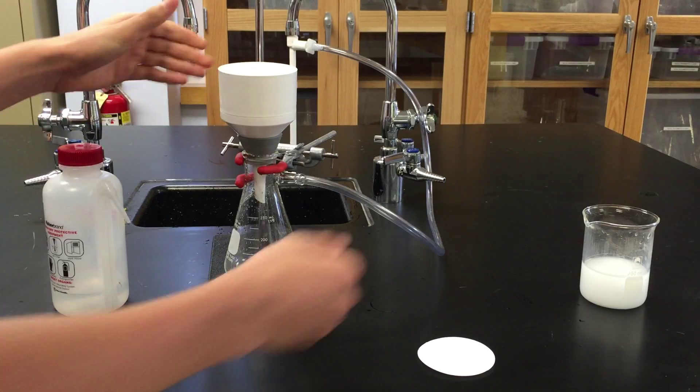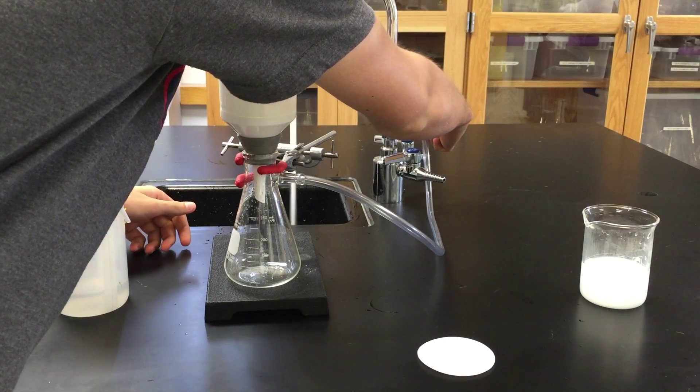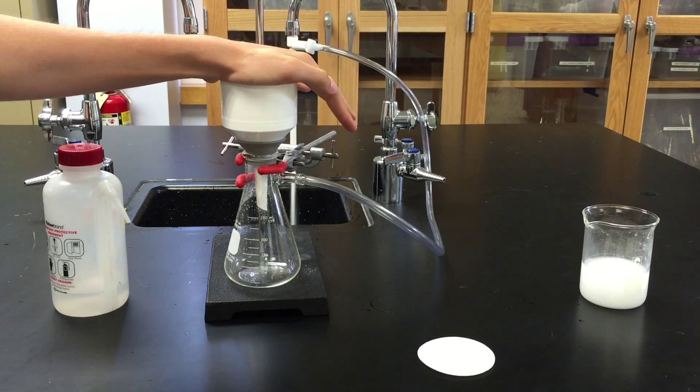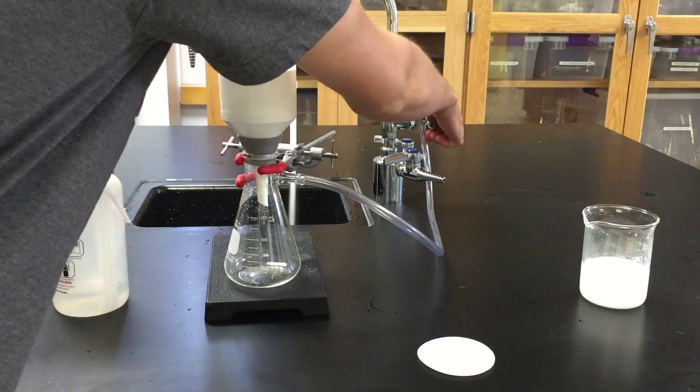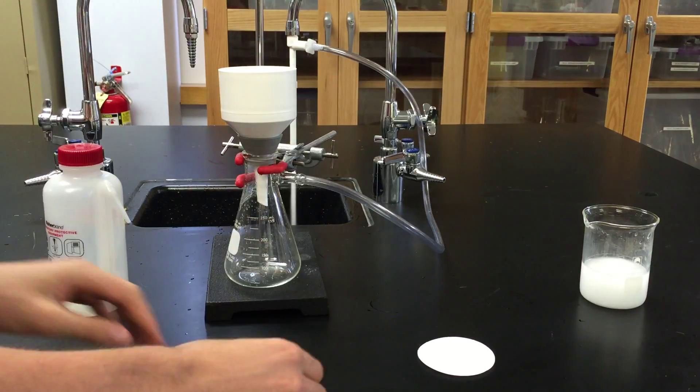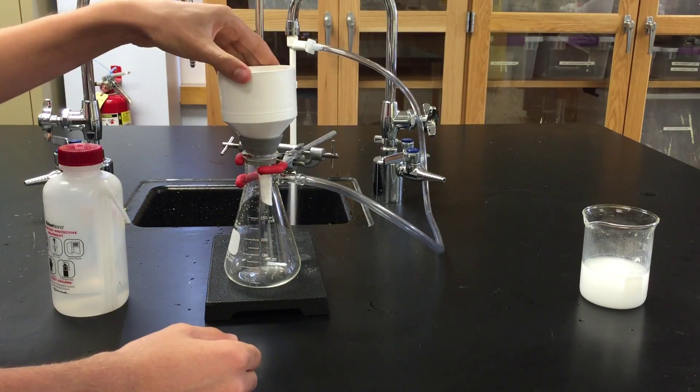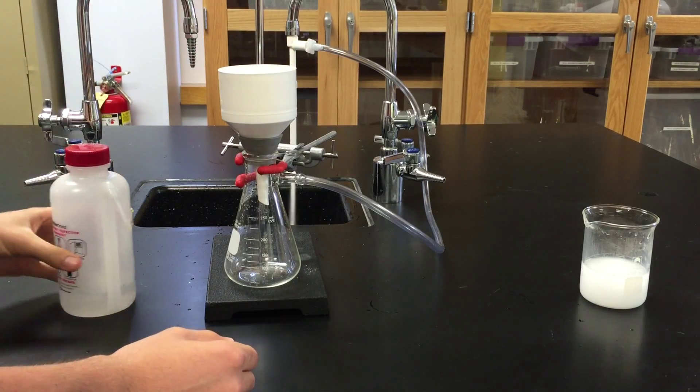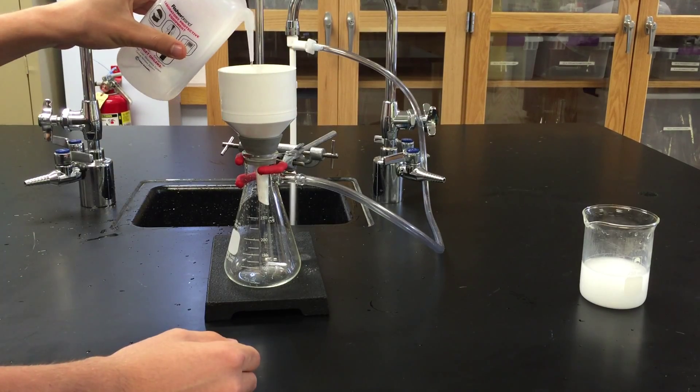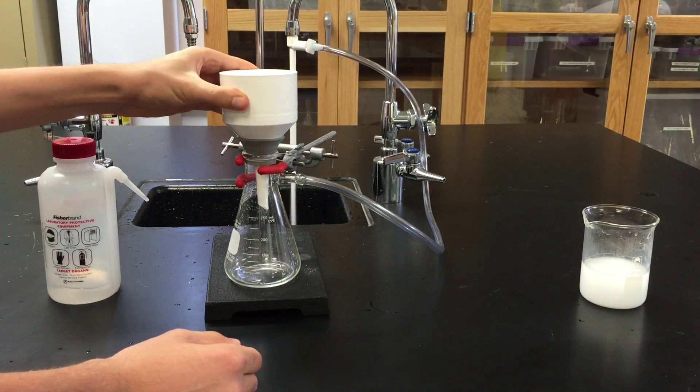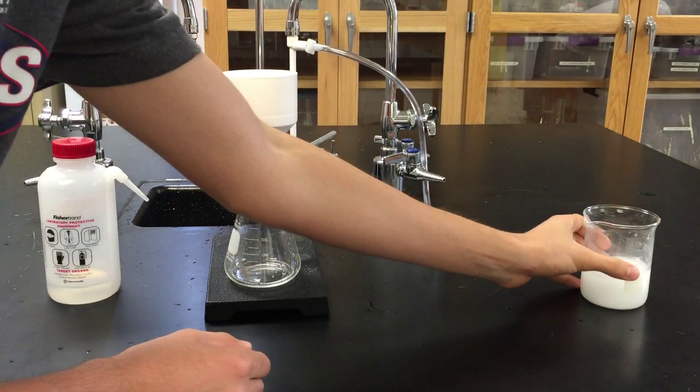Now turn on the water. The adapter connected to the faucet will create suction, and that will help the filtering process. Now place the filter paper into the funnel and squirt some water on it to make the filter paper adhere to the bottom of the funnel and to prevent any precipitate particles from seeping underneath and into the flask.